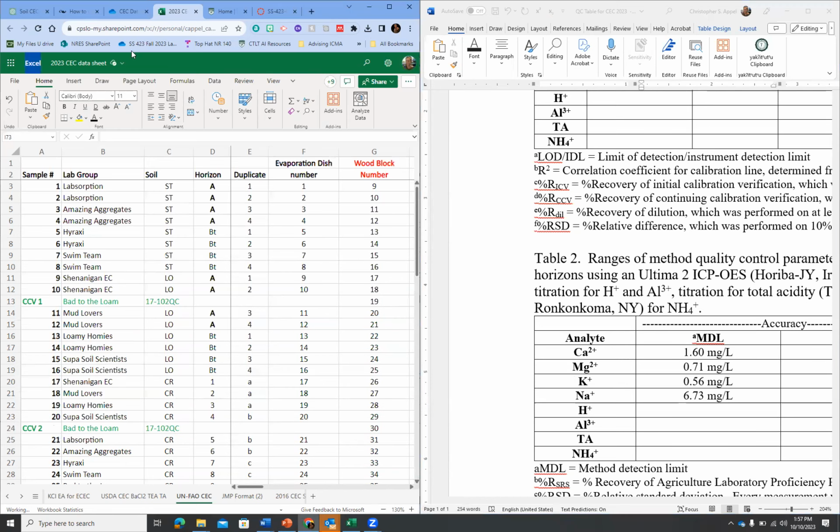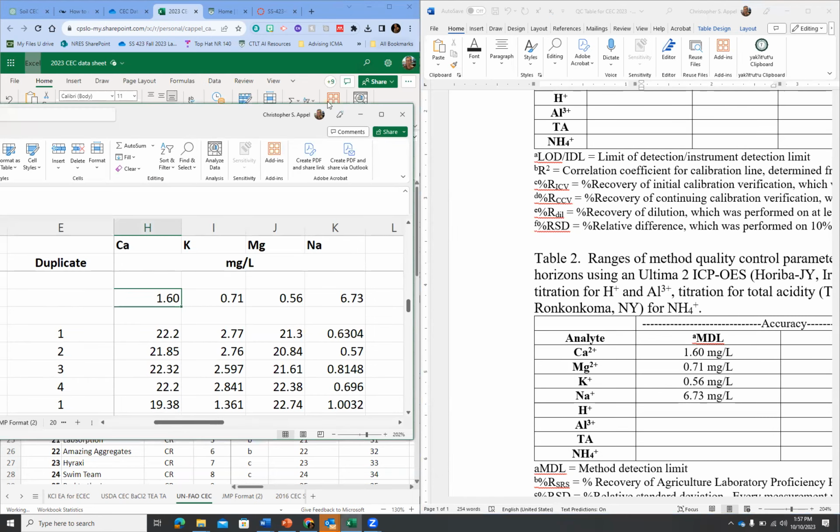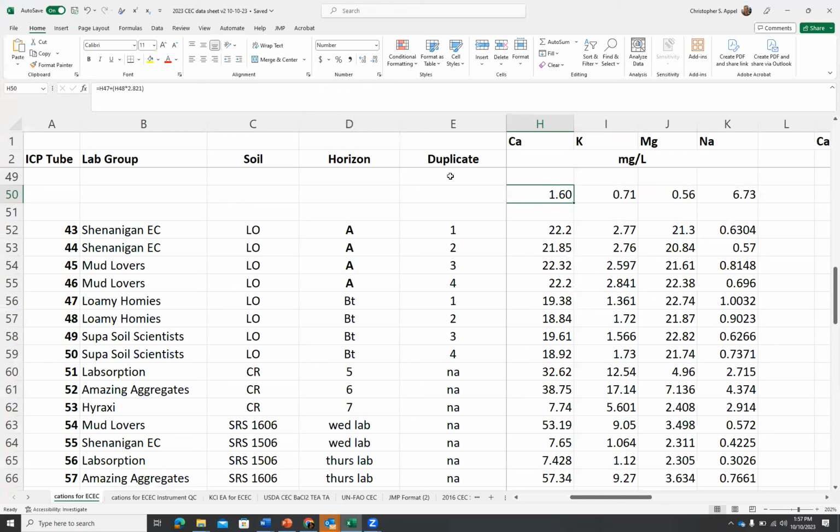And I don't know if you remember me saying this, but it turns out that the sodium is artificially elevated because within the filter paper, there's leachable sodium. And we discovered that over time because our sodium values have always been really high or higher than we would expect.